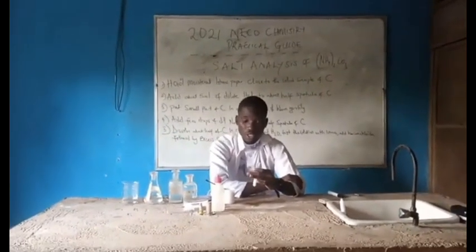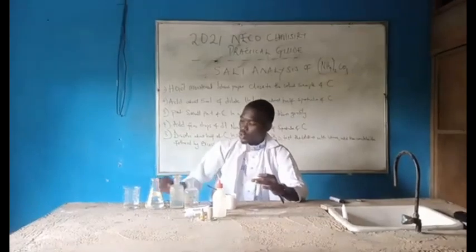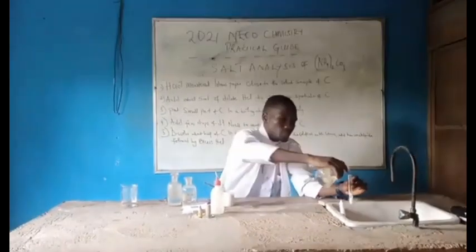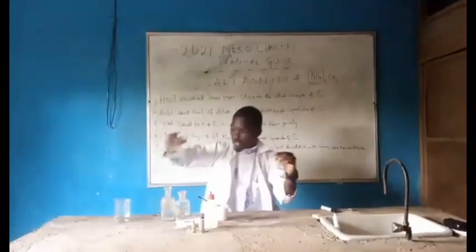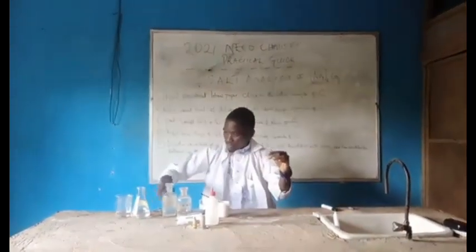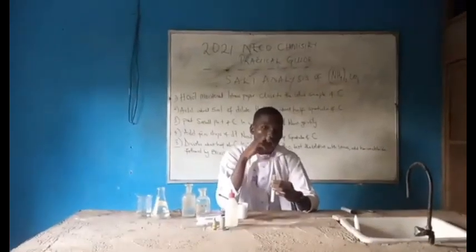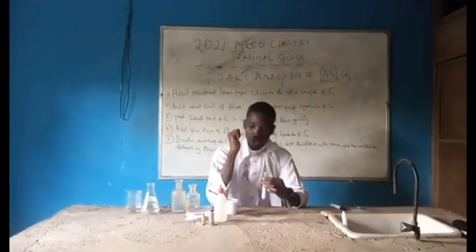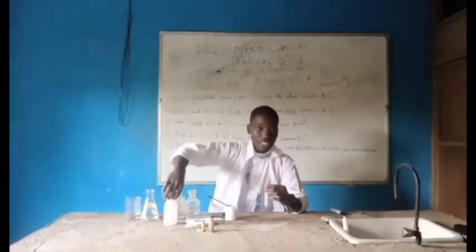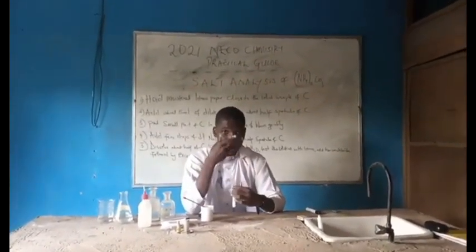These are sample C with distilled water plus few drops of sodium hydroxide. So, as you can see, what I'm perceiving here is a choking or irritating smell. That is the observation. It is choking and what?